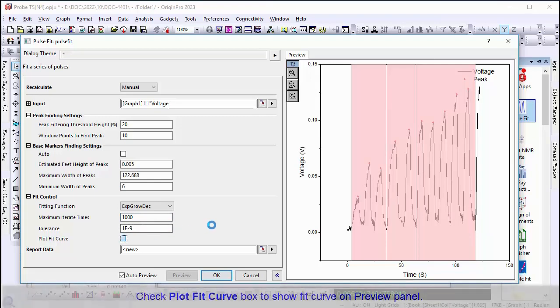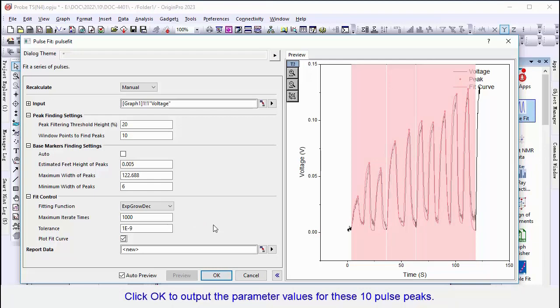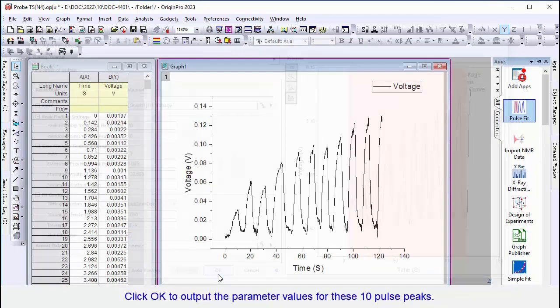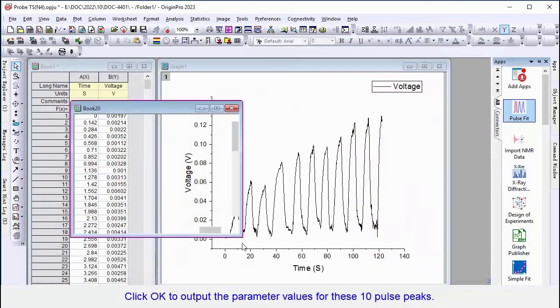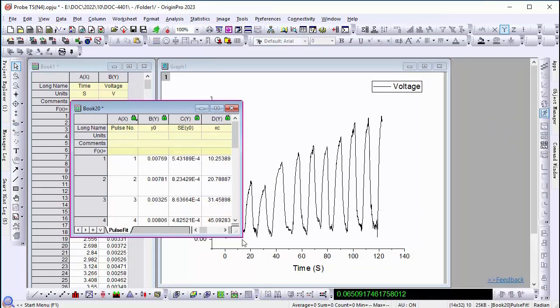Check the Plot Fit Curve box to show the fit curve on the preview panel. Click OK to do the fitting for all the found pulse peaks. A result sheet will be created.